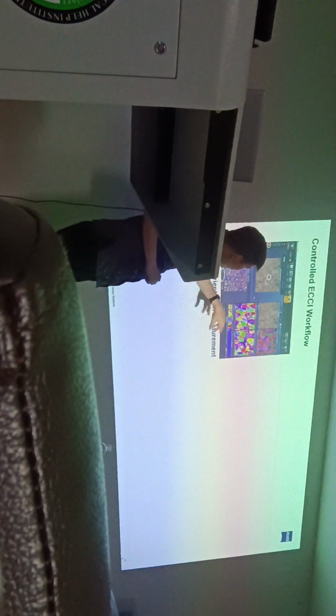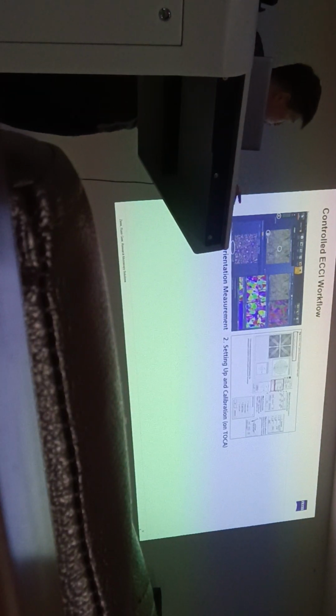Okay, so first of all, we need to go to EBSD. We take the EBSD raster, and we will find the orientation. So we have a lot of grains here. For example, I want to know the defect at this particular grain. I need to read the Euler angle. I go to the other grain, I will go to the other orientation. We need to jot down these 3 numbers. We call it the Euler angle. Euler angle basically describes which orientation we are looking at against the fixed 0, 0, 0 position, right? So we got the Euler angle. We go to the simulation software.